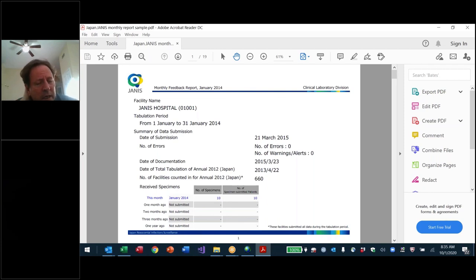So they ended up doing a lot of custom Vietnam programming. And the Vietnam platform is 3 years old now. Over the years, they've moved more and more away from DHIS2 features to their own customized features. So what they did in Vietnam is very, very nice, but it's not transferable. It took a lot of expertise to do what they wanted to do. Things like first isolate per patient, DHIS2 was not ready for that. Doing antibiotic interpretations, they were not ready for that.